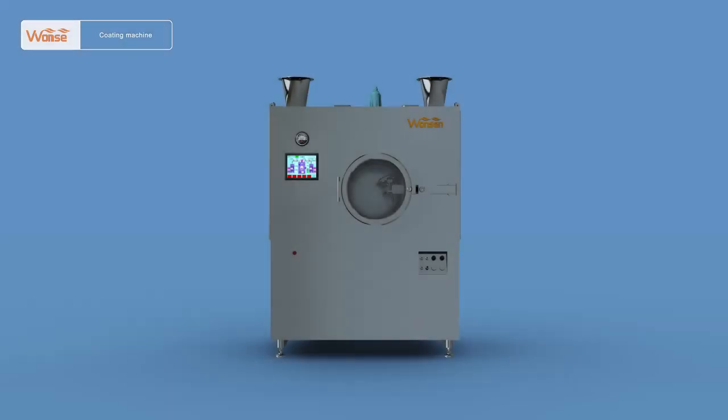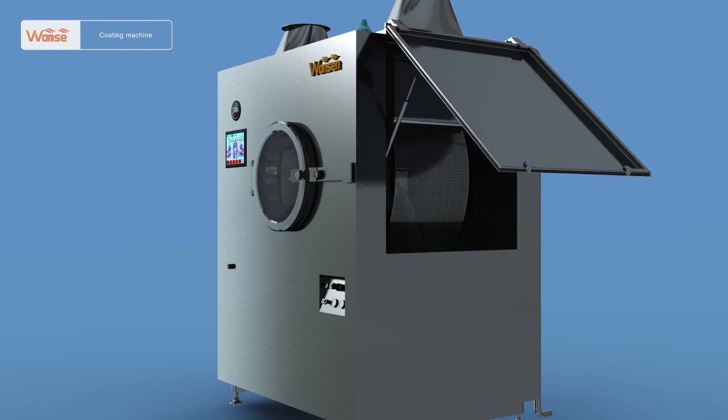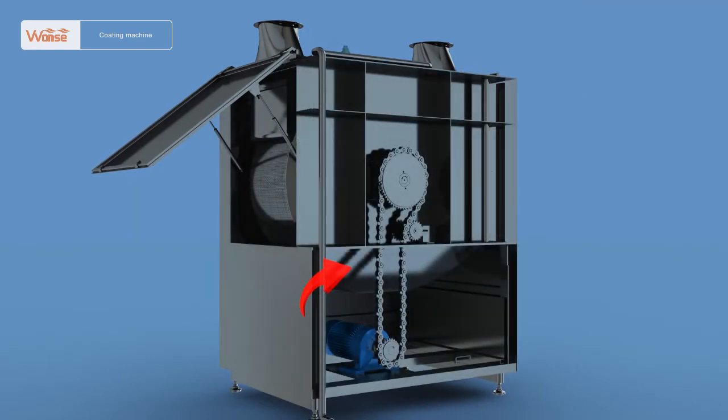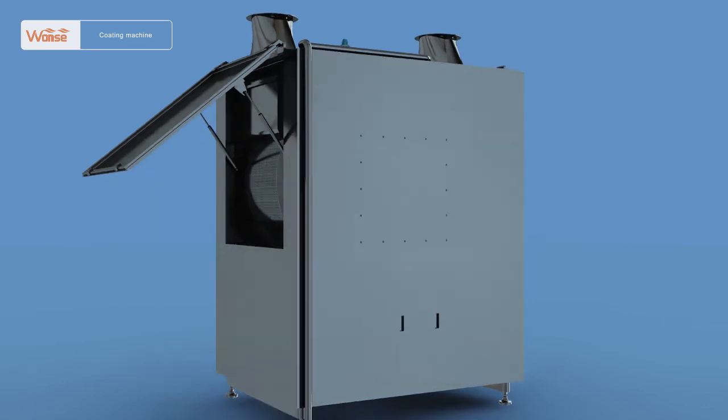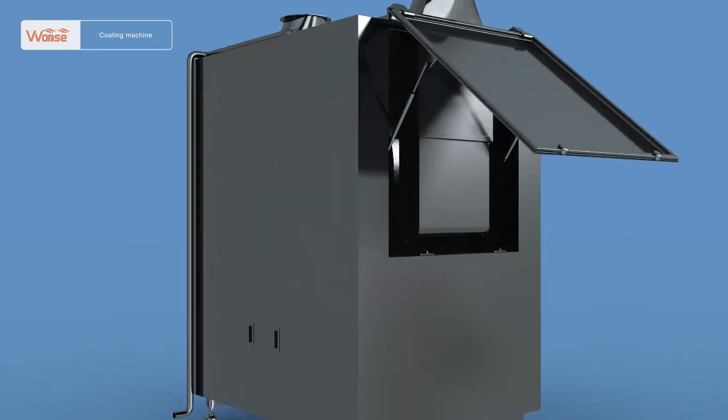The main machine is mainly composed of the upper and lower casing, fully closed front door and side door, semi-circular water tray, explosion-proof motor, driving system, air inlet device, air outlet device, and touch screen.